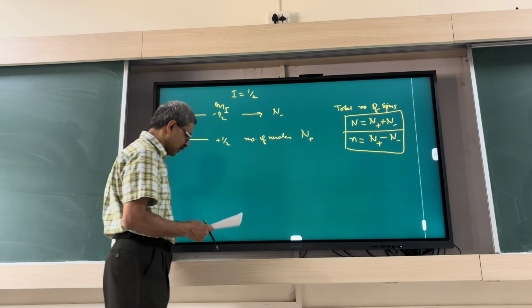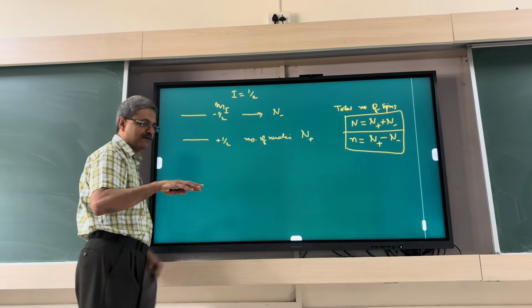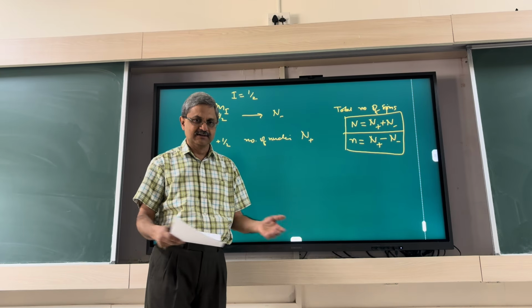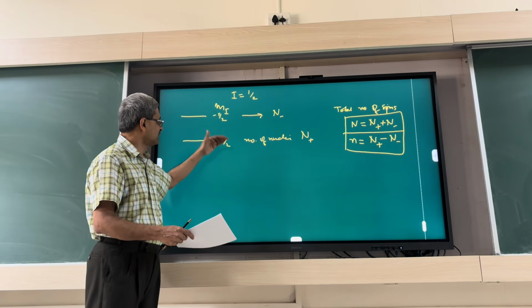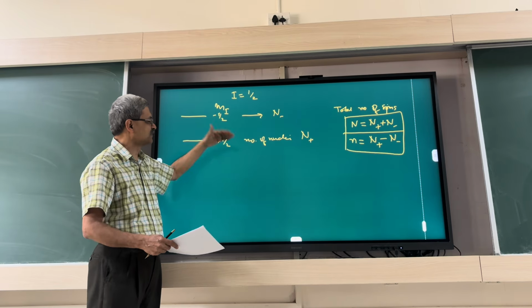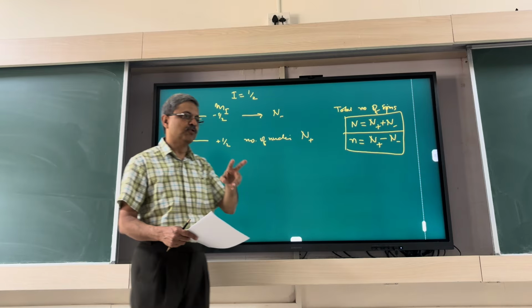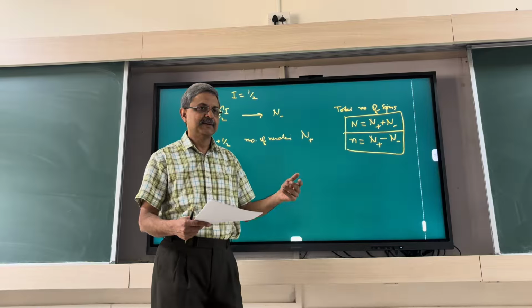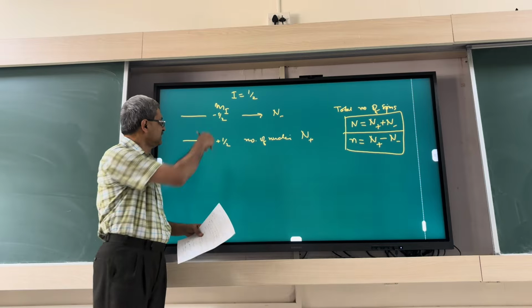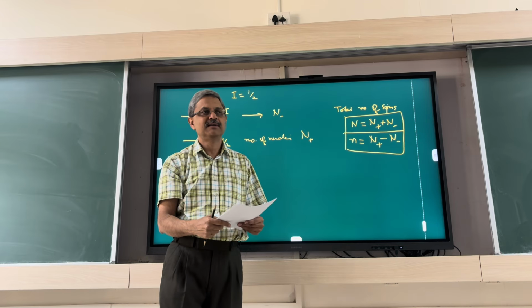Yeah, so what we are interested in right now: we said you have a sample, a system, nuclei with spins, and so some occupation of the ground state, in the simple case of spin half, and some occupation of the excited state. And then there are two ways you can get transitions. One is, of course, a matrix element which causes transitions between these. That's the external AC field that you apply, okay?